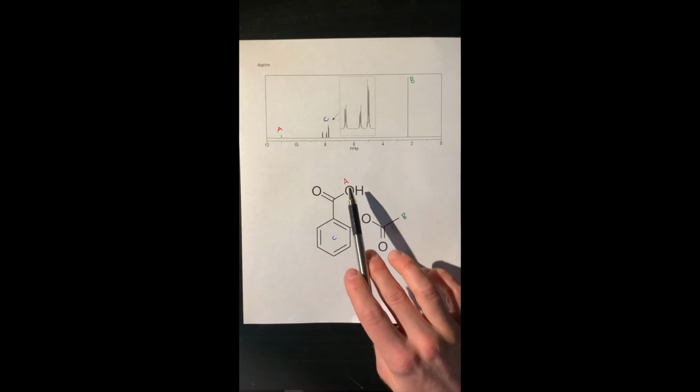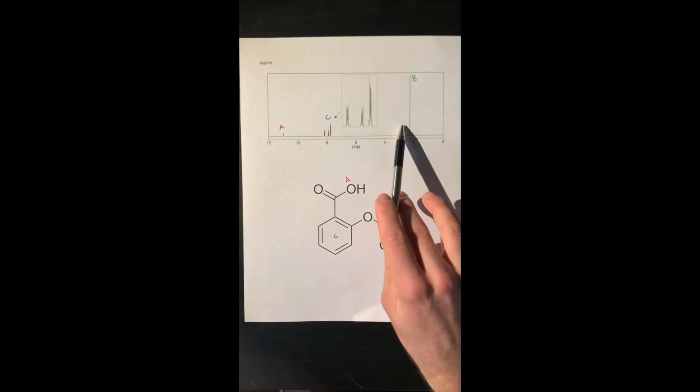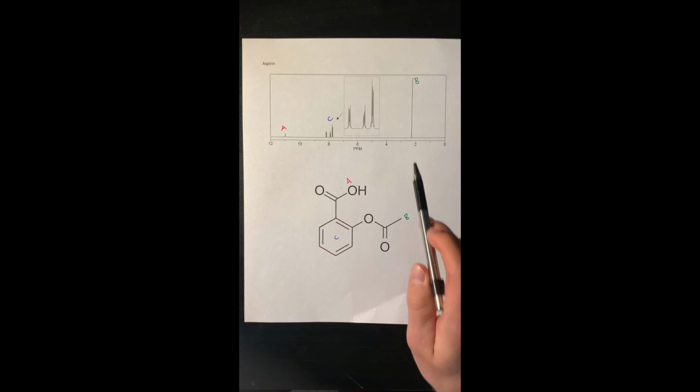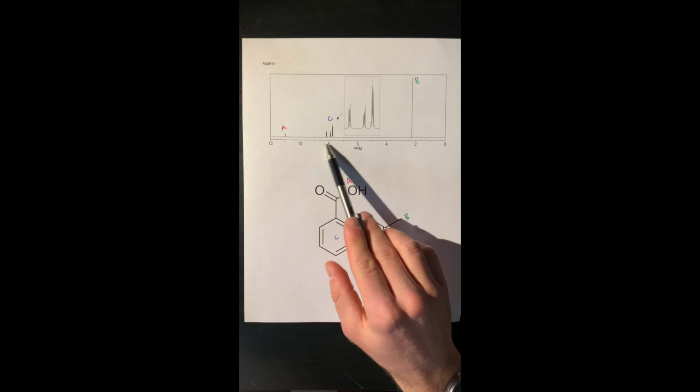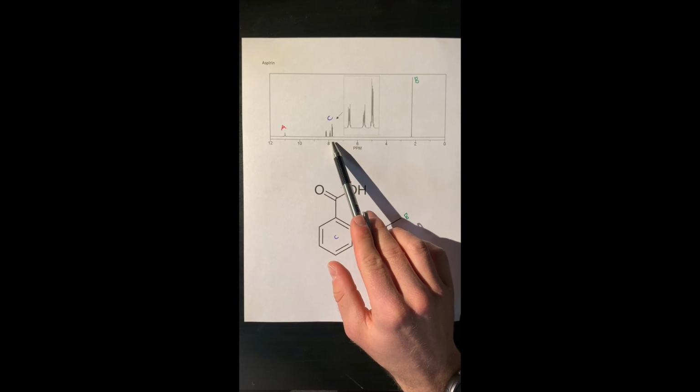So once again, I have the structure here for you guys below, and we have A, B, C up here. And it's easier to visualize what I'm talking about, I think, if you guys can see it. Even though on any exams and stuff, you might not have the structure. But this NMR has 5 major peaks, or sets of peaks, I guess, anyways. So the first one here is a singlet at about 2.2 ppm. And then there's 3 sets of multiplets here between 7.8 and 8.2 ppm.